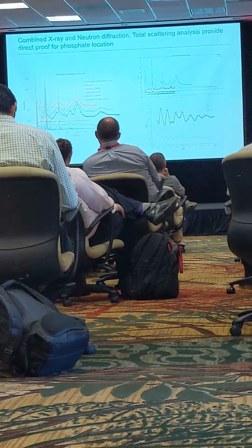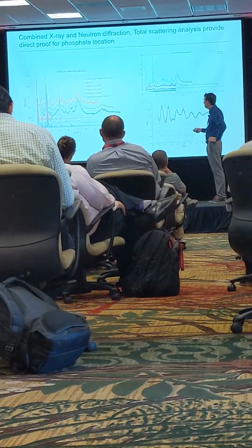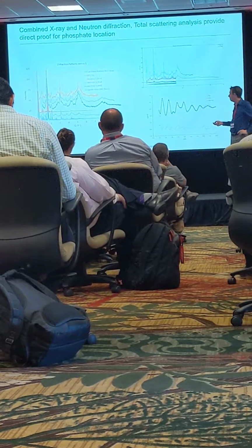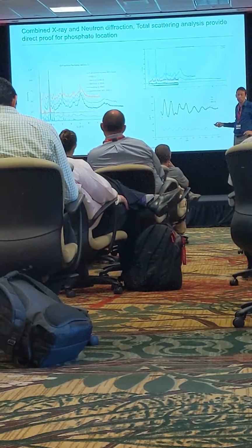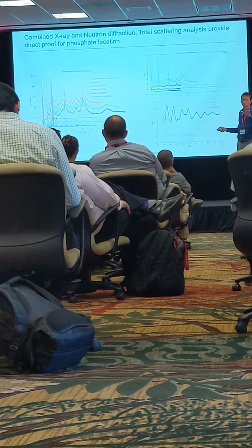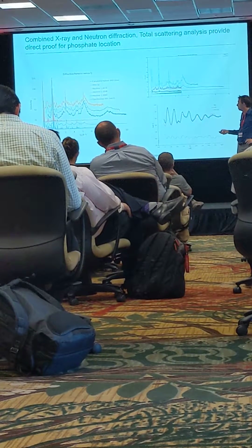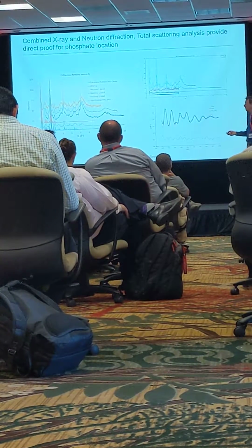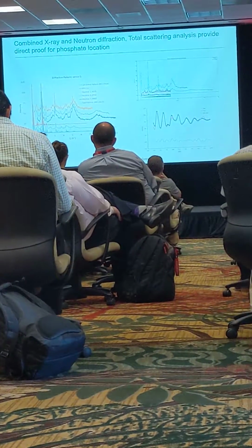Now, standard XRD scan for ZSM-5 is going to be kind of like this orange one, right? XRD scan, copper-based radiation. This is what you're going to see pretty often out of most routine laboratory instruments. And the thing that'll jump out for you right here is that at a Q value above 3, there's not a lot of information left, right? What that means is you're missing the short-range interactions that are really relevant to the small atomic configurations. Now, these high-quality X-rays that are available from that French facility are already showing us a lot more information at a Q value above 3. And look at the neutron diffraction data. There's all kinds of information in there. And it might just look like noise, but it's far from it.